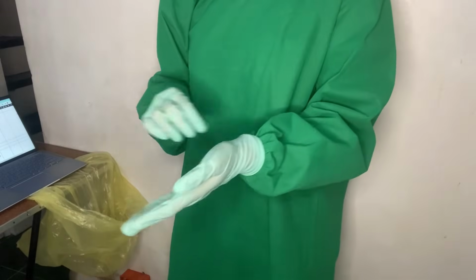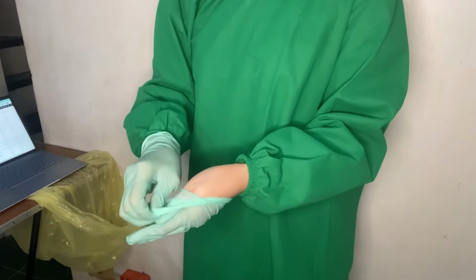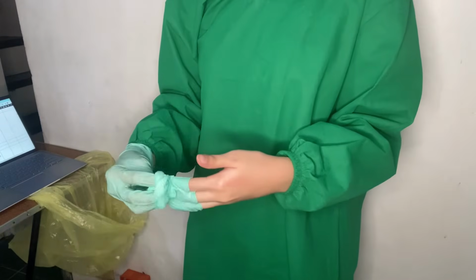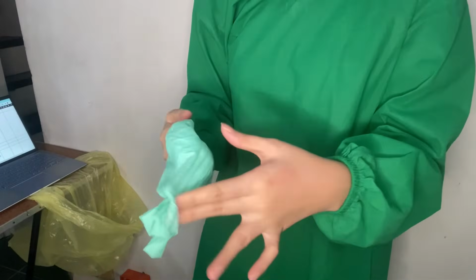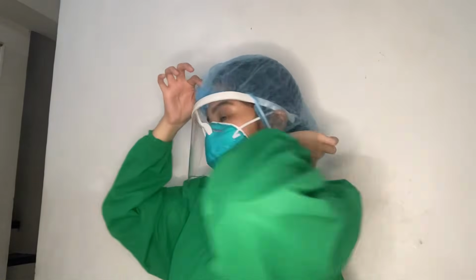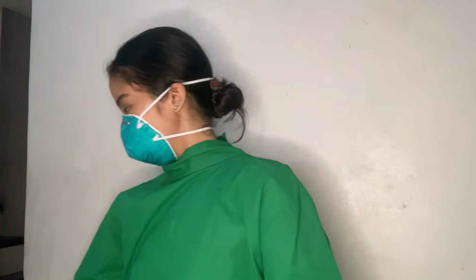Before leaving the room, make sure to remove the gloves and dispose. Grasp and pull the glove away from the hand. Slide 1 or 2 fingers of the bare hand inside the wrist of the gloved hand, then dispose the gloves in the yellow bin. Now we're going to remove and discard our bouffant cap. Then we're going to remove our goggles or face shields.